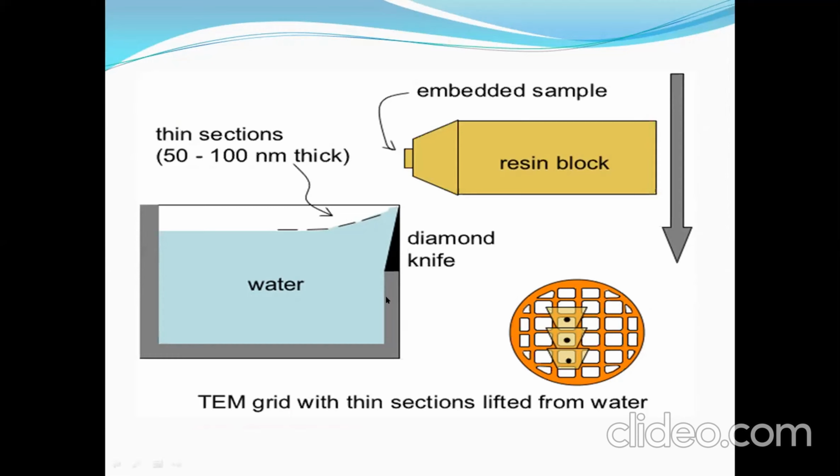So this is all about the microscope part. Again I am saying, I'm not going into great detail of the steps of specimen preparation, because there are lots of modifications according to your specimen. What type of fixative you have to apply, what type of stain you have to apply. There are lots of modifications and optimization according to the specimen you want to view under EM.